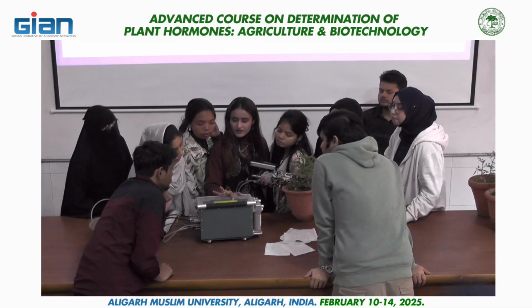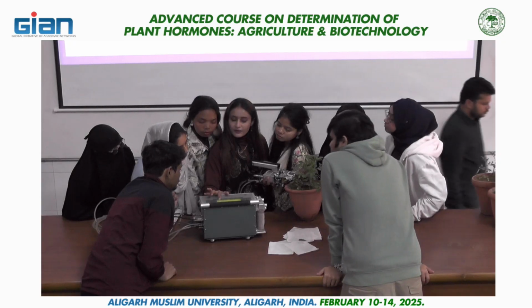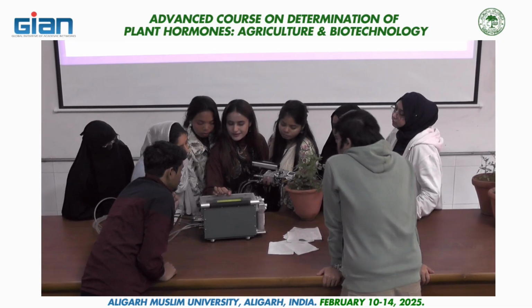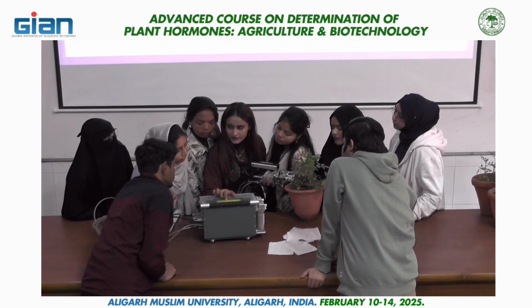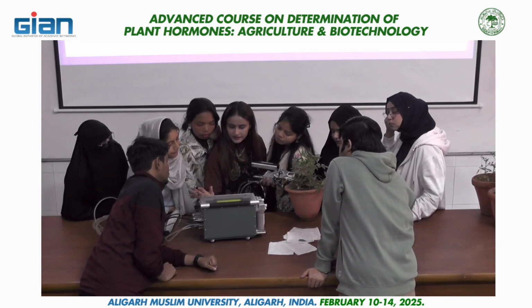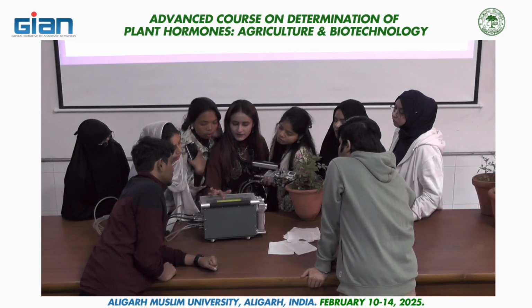Here we are having photosynthesis. You can see clearly Ci, transpiration. These are other parameters, flow meter. As you can see here, we are having S, CO2 S. S is for sample and R is for reference, as I have shown you earlier. Fine. So now the reading is in negative. Just click on F1, F4.